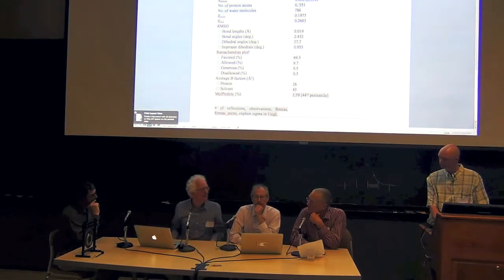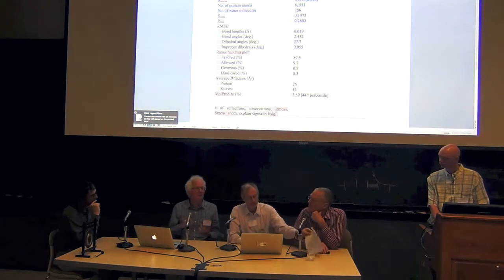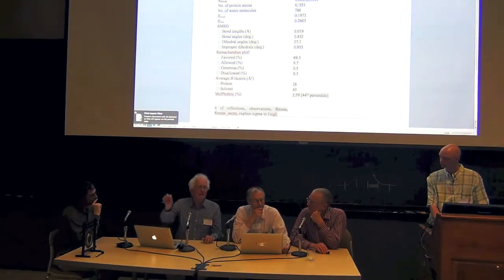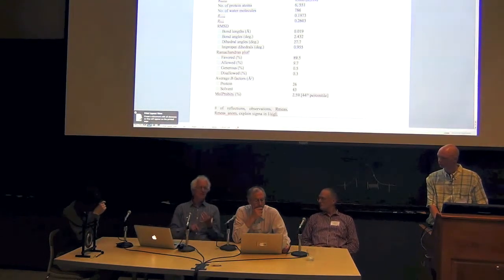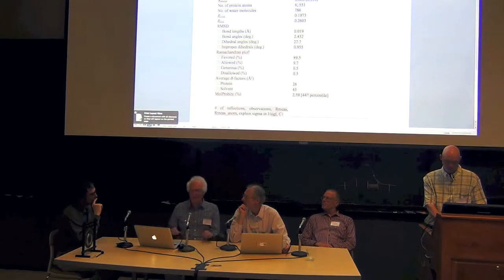These sort of statistics don't really tell you the information you actually want to know, which is how reliable it is. In the end, what you want to know is that somebody has decided that there is a hydrogen bond between this bond in their ligand and the residue in the protein. And no data processing is going to tell you that. No global refinement statistic is going to tell you that. What will tell you is an unbiased map, actually. And that's not for use. So I'm not absolutely convinced Table 1 has any great value at all.